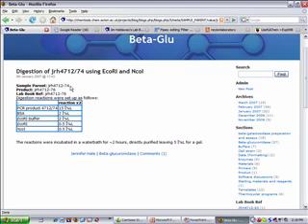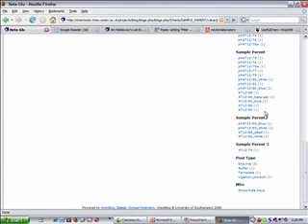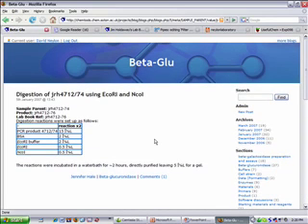And I think you probably immediately see what the problem here is, that as soon as you've got a reaction where you're putting 2 things in, you're in trouble. So we ended up, as you can see as you track down here, with sample parent 2, sample parent 3. This is just starting to get a little bit ridiculous. If I just show you, I'm not allowed to edit this one. So we have this problem.